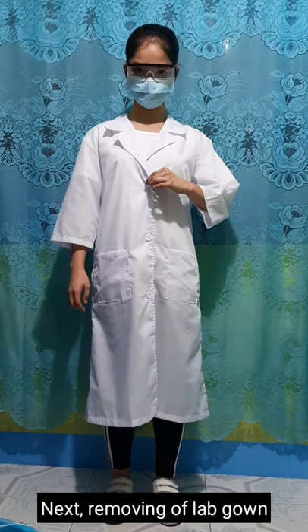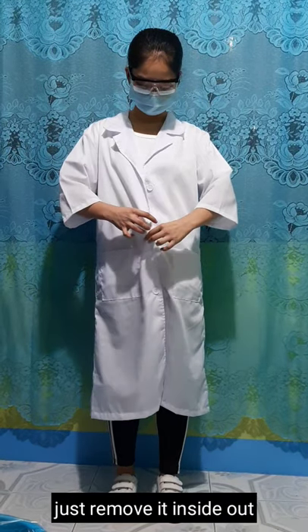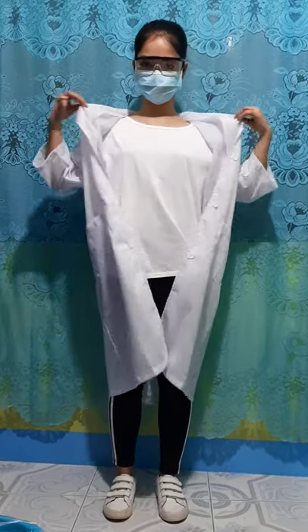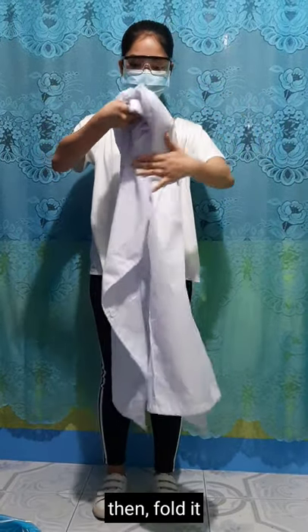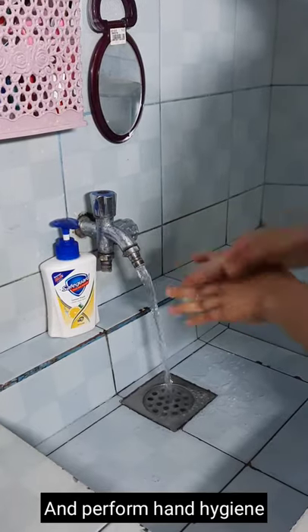Next, removing the lab gown. Don't touch the front of the lab gown, just remove it inside out. Fold it, discard it, and perform hand hygiene.